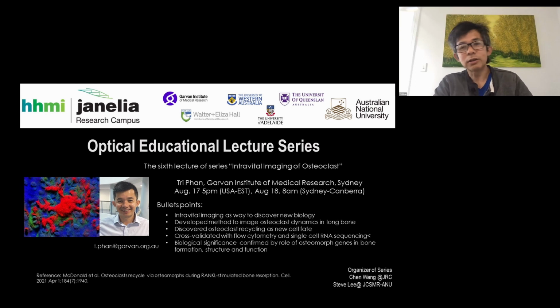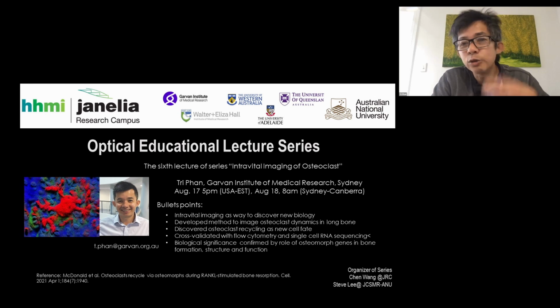Absolutely, yeah. So I think this is one of those examples where we do what we know how to do, and so it's your standard 1.0 NA 20 times water dipping objective.